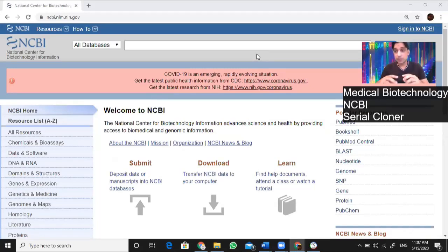But since the sequence we were working on in our last class was the sequence of insulin, whatever you were looking at that time was only the protein coding sequence, which is called CDS, 5' UTR, and then the 3' UTR, together with the CDS. And let me just repeat that activity quickly. You need to go to NCBI, go to the gene if you want to get the sequence of a gene. That does not mean NCBI is only meant for this purpose. NCBI can do a lot of things, just nothing which I taught you.